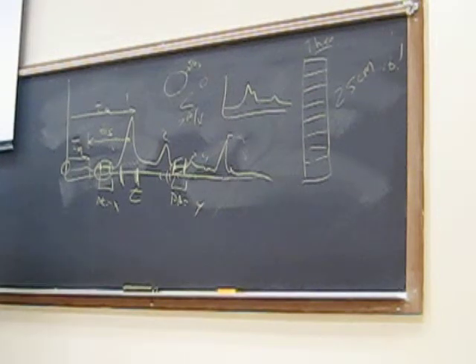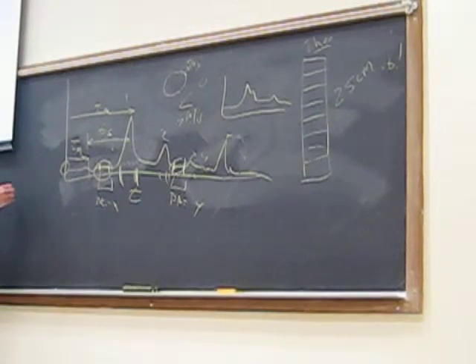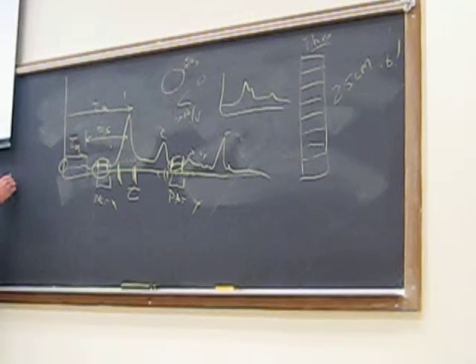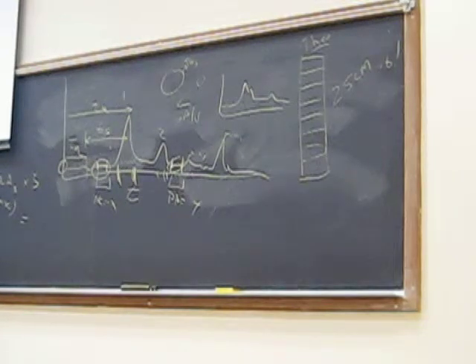So now, if we did this, because of how I integrate that, I have some number, its peak area. So now I have the peak area of my baseline, right? I then multiply that times 3. So this is my noise, right? I multiply that times 3, and now I get a bigger peak area in my baseline, right? Now what do I do with that? Subtract it? No, divide by your slope from the standard curve, right? For each analyte.